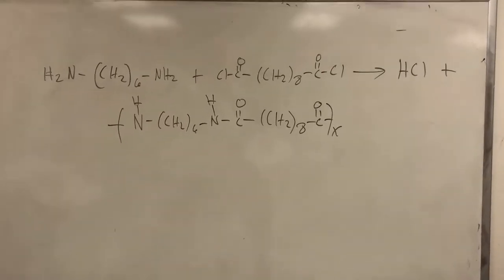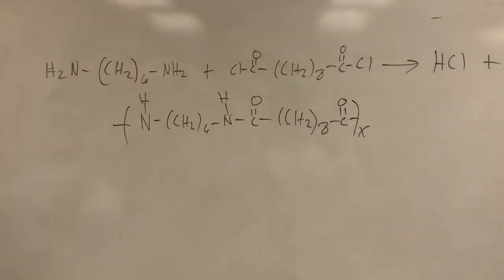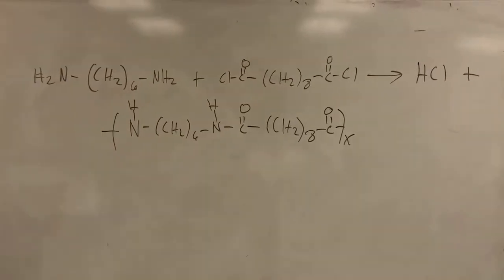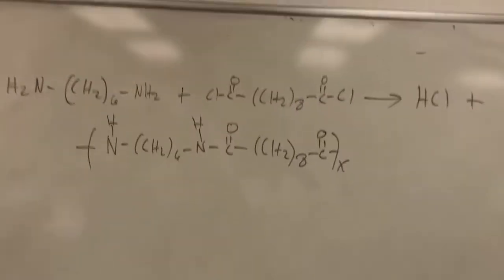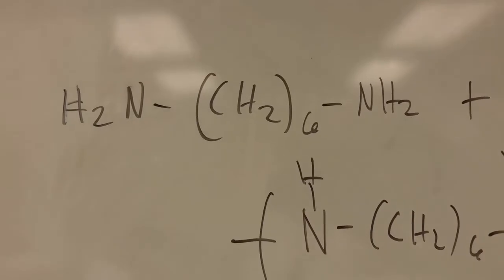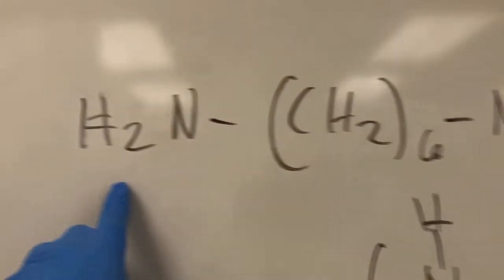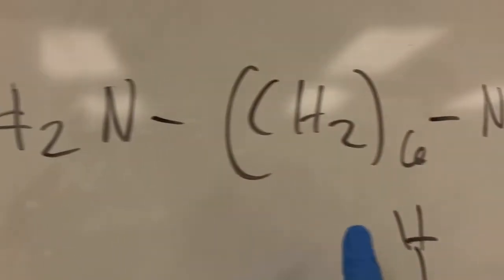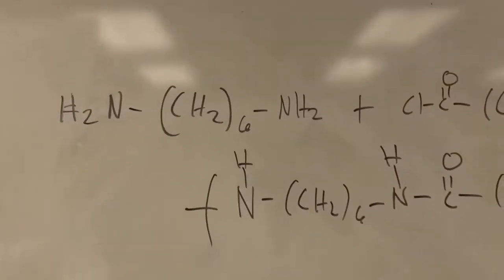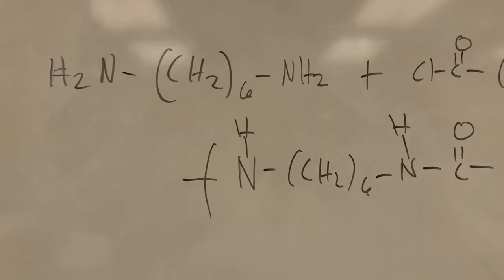So we're not going to have any chain propagation. We're going to have step growth. So we are going to do our nylon 610 interface polymerization. We are going to mix, again, our diamine, 1,6-hexane diamine. So again, these amine groups, H2N, so CH2 times 6. So that's going to be one of our steps in our reaction.